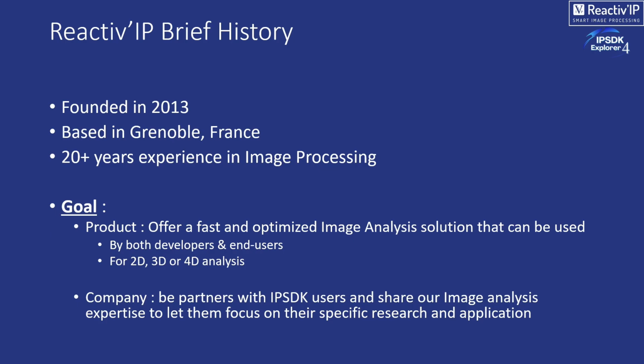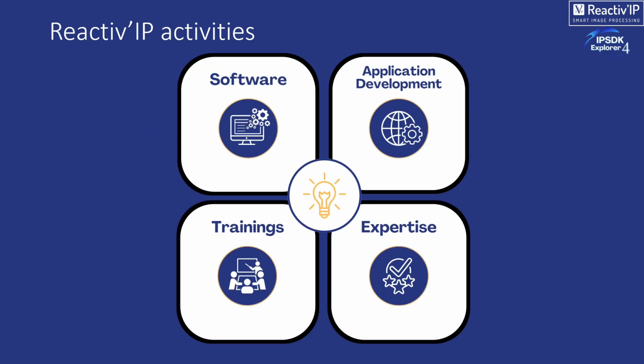And as a company, we are experts. We are quite old in image processing, so we have plenty of experience. The idea is that you can really focus on your own research, on your own industrial application, and you can rely on us to translate your human words into algorithms. Let us build for you. Subcontract to us all this image analysis creation, so that you can really focus on the results and understanding the results.